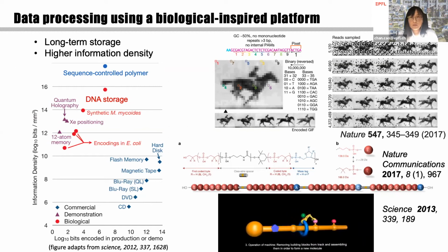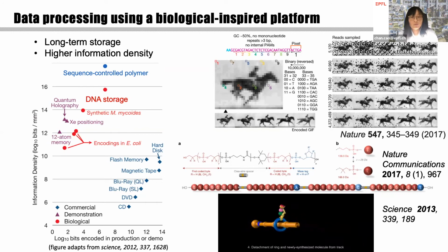And a few years ago, our collaborator from the CNRS came to us and said, why not try the nanopore to sequence these polymers that carry the digital information? That's how we started.